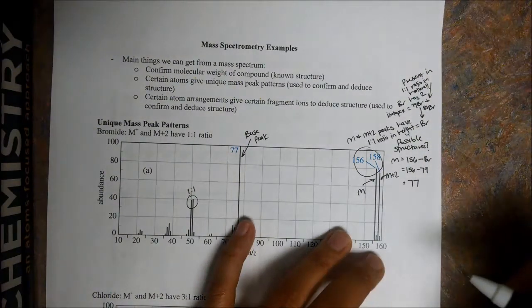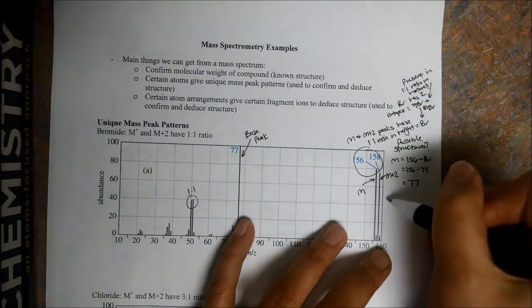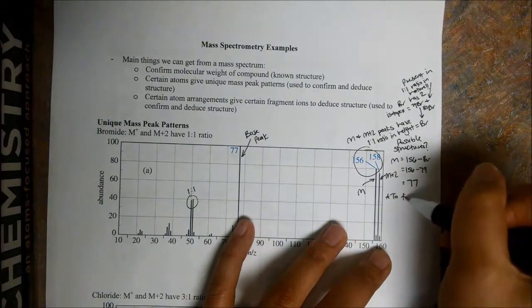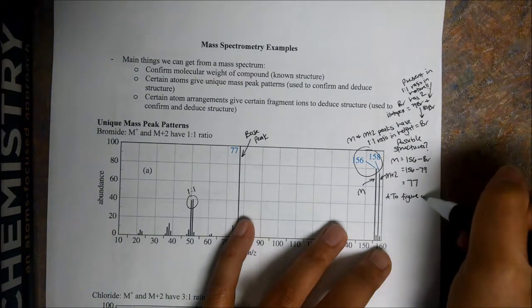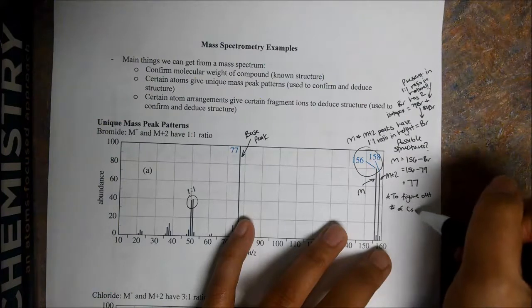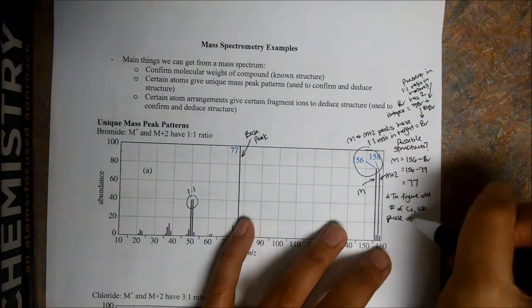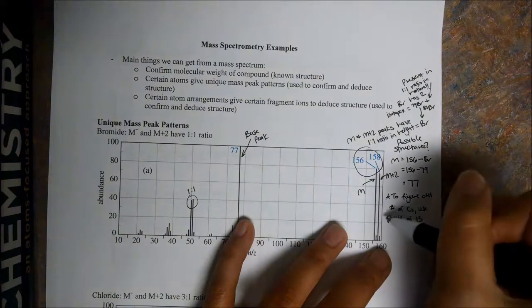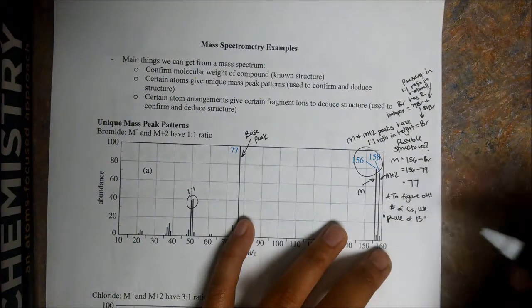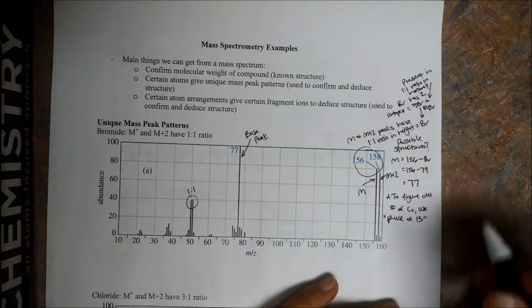Then what you can do is use the rule of 13 to figure out the number of carbons. Which is pretty much you just take your mass and divide it by 13.